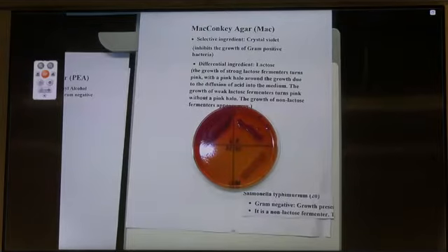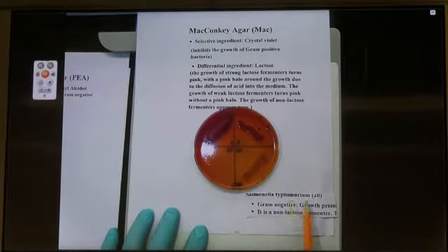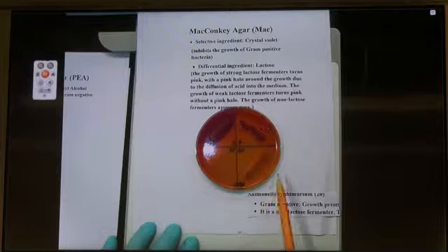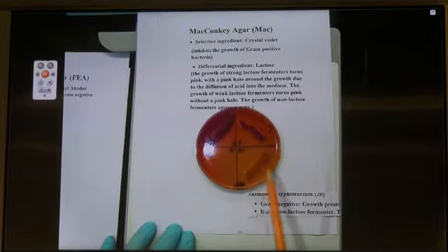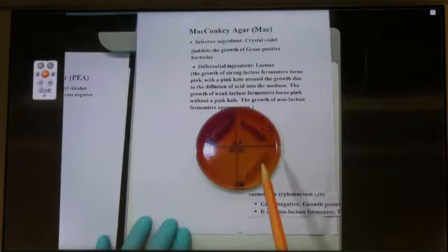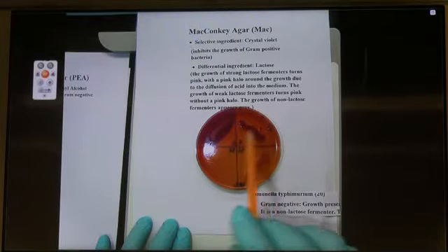All right. This is number 20 bacteria, Salmonella typhimurium 20, gram-negative, growth present. It cannot ferment lactose, that's why the growth is gray. The growth is gray. The bacteria that ferment lactose, they are pink.